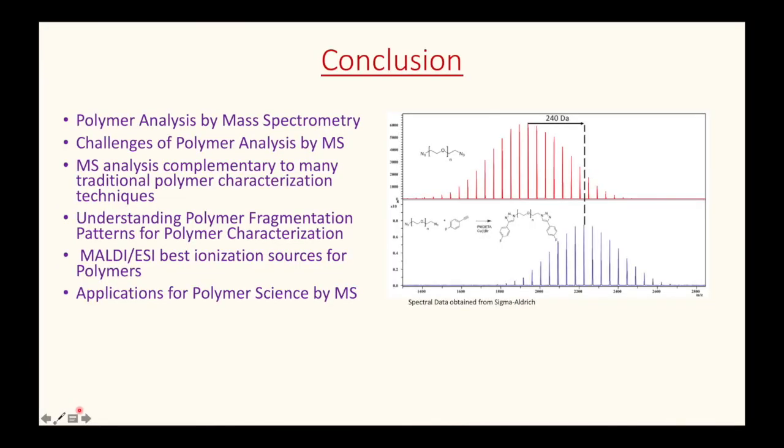All right, so to conclude the major highlights of this presentation regarding polymer analysis by mass spectrometry, it's really important to understand what information you seek and what is the best approach to obtain that information. Mass spectrometry is definitely a complicated process, and there are certainly many limitations that can complicate it even more, with respect to sample preparation.